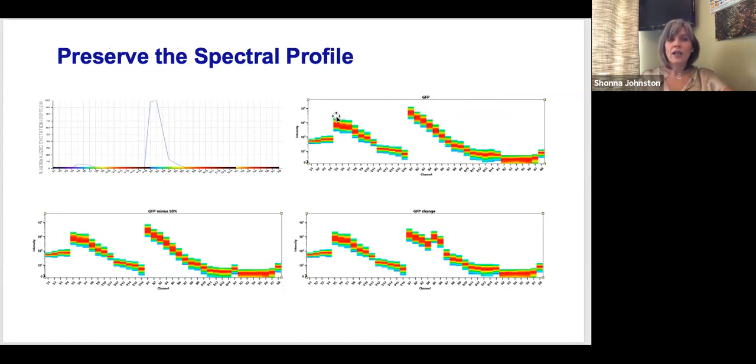So that's great. If you want to start adjusting voltages, how do you go about doing it? Well, one of the things that I did was I just started playing around, and obviously with the Cytek it's an APD, so it's gains that I was playing around with, and you can see that I can completely change that spectral profile. Although in a normal filter-based system it's really important that you get the optimum voltages and that everything is working nicely according to your cells as well, if you start really changing the gains around on these APDs, you will dramatically change that spectral profile. So it's not a good idea to do something like that.